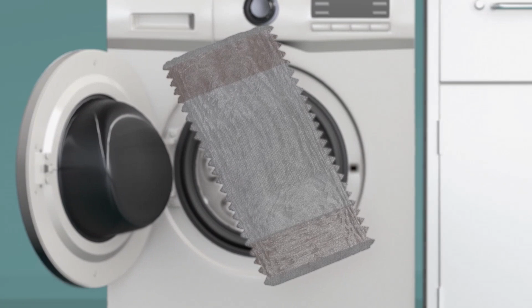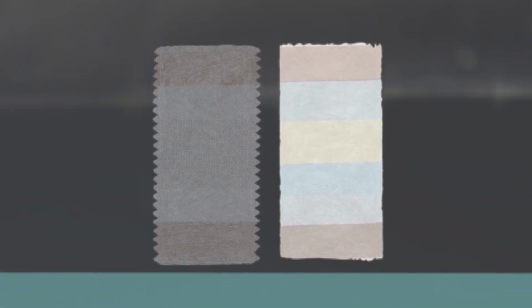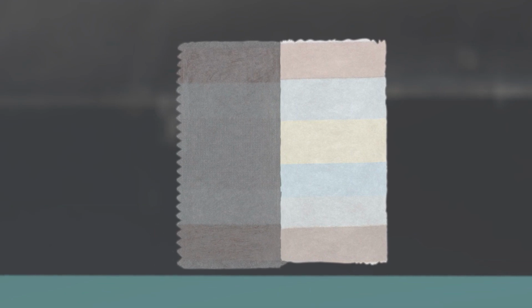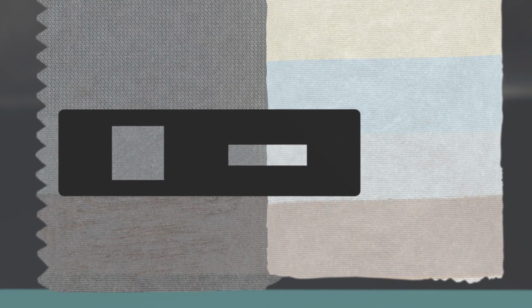To assess staining, take a piece of SDC's multi-fiber DW. This should have undergone the same procedure, such as the laundering process, as the piece of multi-fiber being used to assess staining. This removes any potential variables, such as the effect of detergent on the multi-fiber DW, to guarantee a fair test. Place the multi-fiber DW alongside the stained sample of multi-fiber DW, again ensuring that there are no gaps between the two fabrics. In line with the same principle as assessing change in color, it's essential to mask off an area of the same size for consistent and efficient assessment.